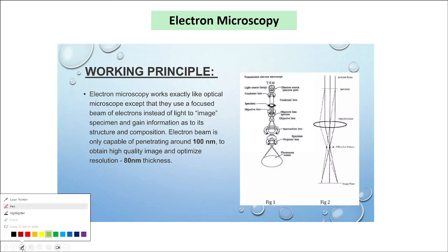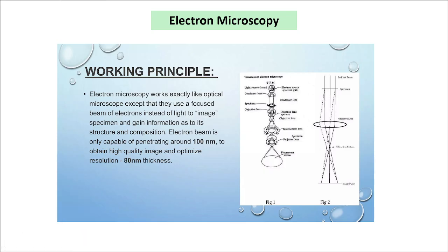Now, suppose at the first stage, what we did, we have seen we are getting a particular spectra, and now we know that if we are getting a particular wavelength of light, that is characteristic to a particular kind of nanoparticle that we are talking about. But still, at this level also, we have not seen if this wavelength is because of these spherical gold nanoparticles. Now we need to visualize it.